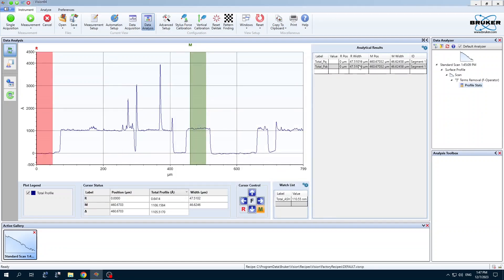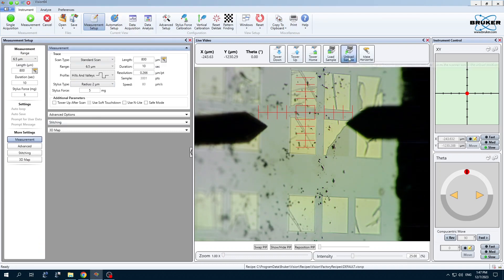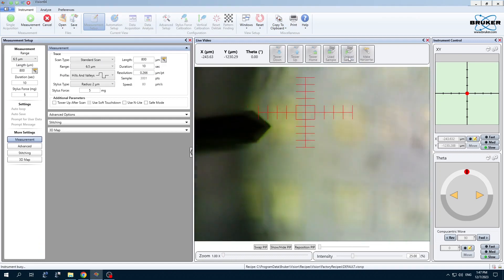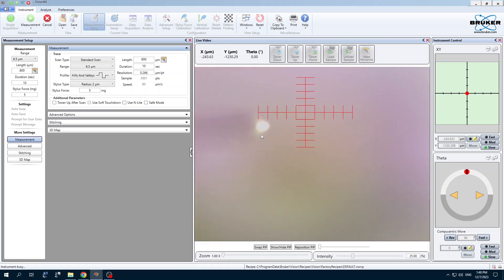For finishing up, click back on this measurement setup to get back to the main screen. We can just click unload sample, and that will lift up the stylus and move the stage all the way up in one step to remove your sample.